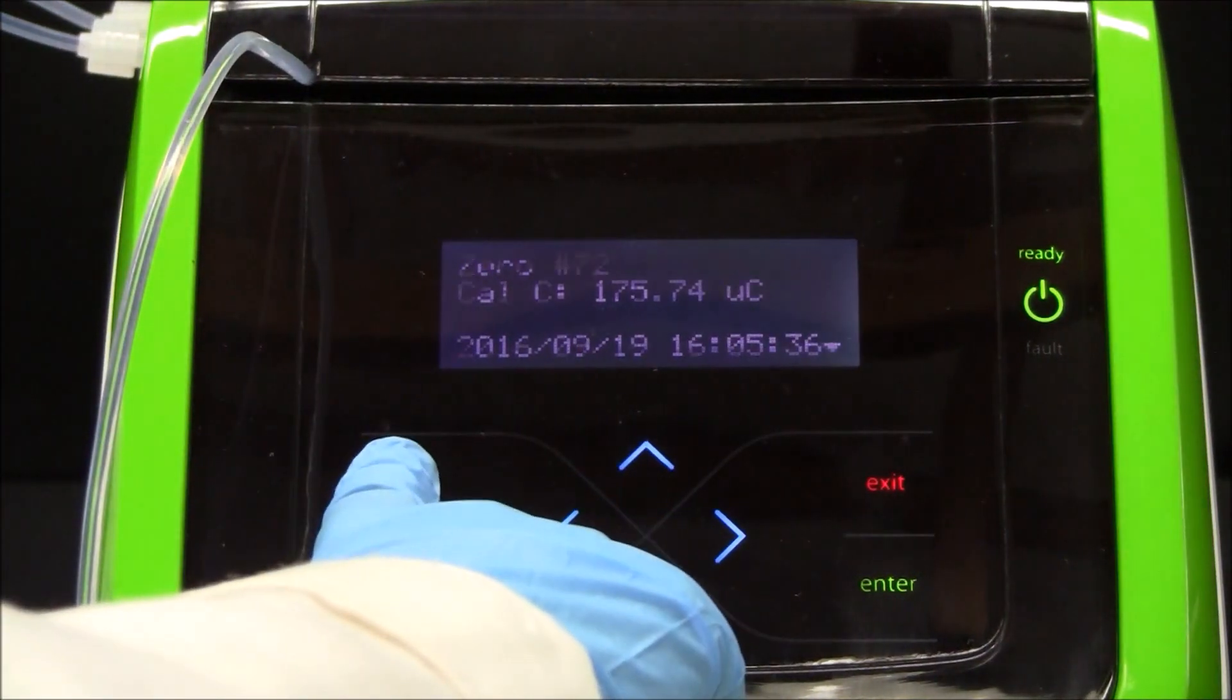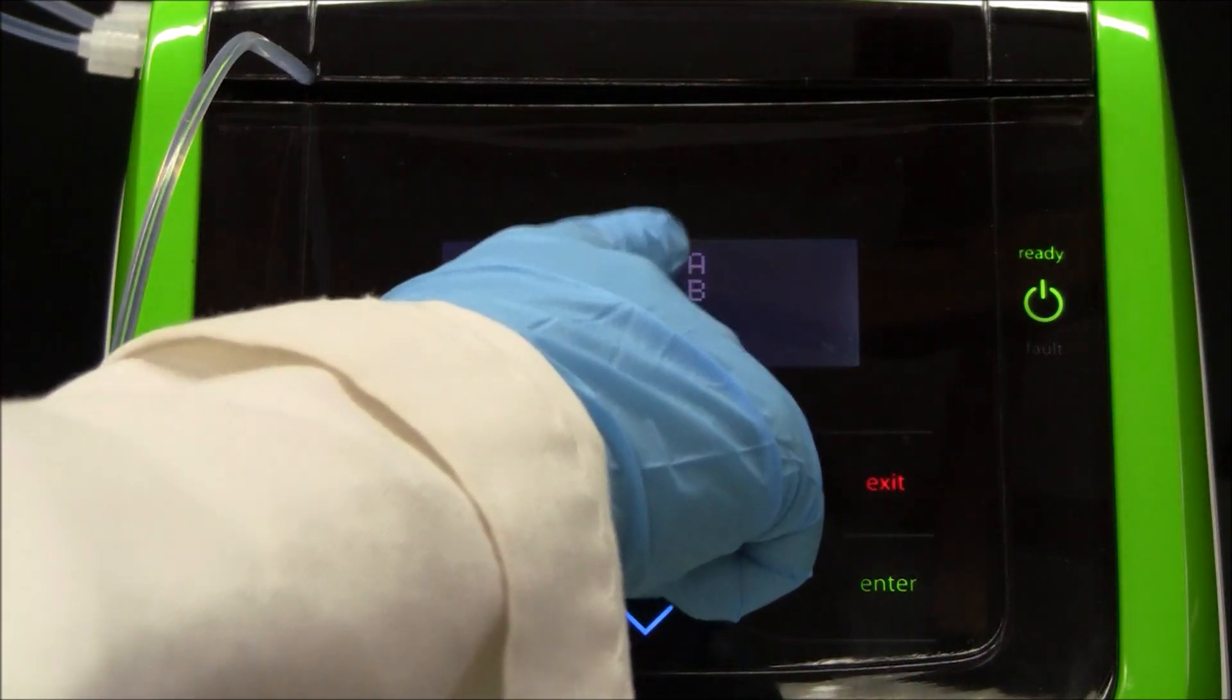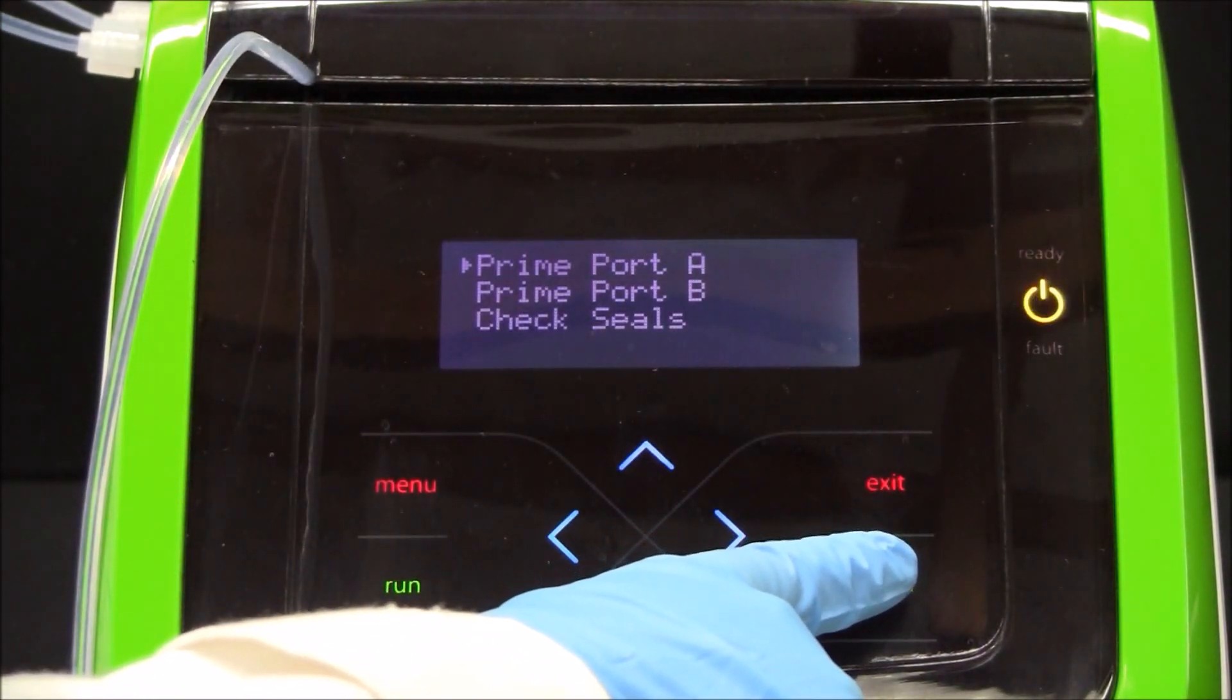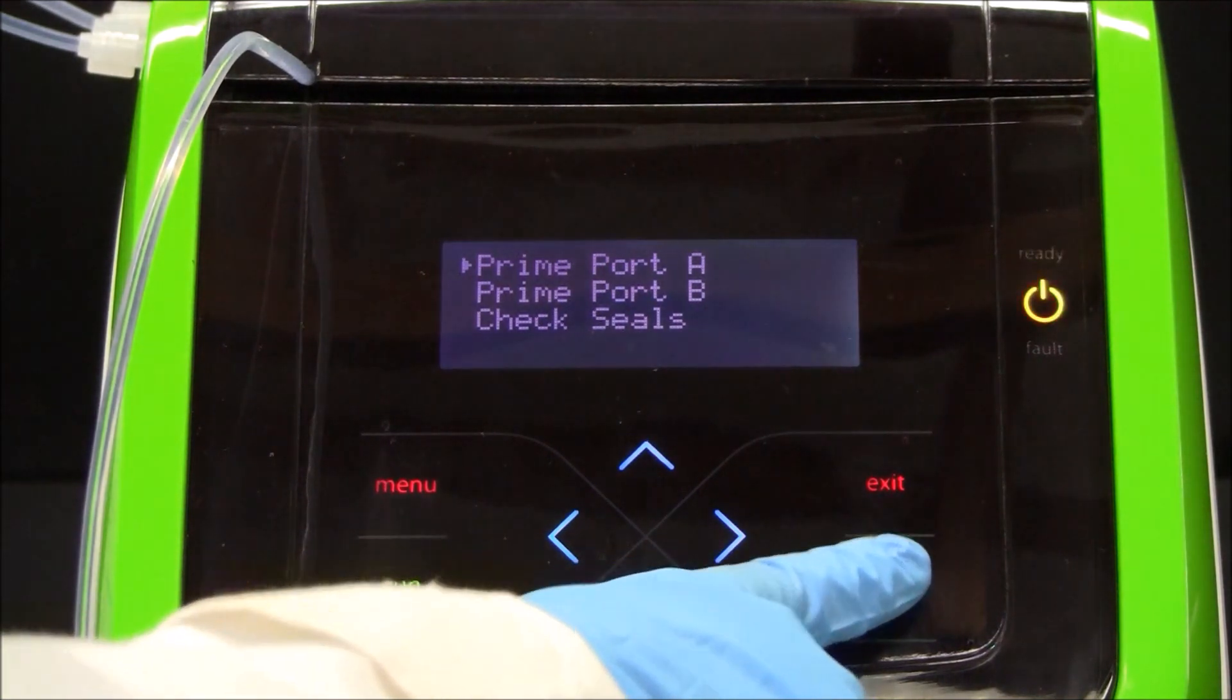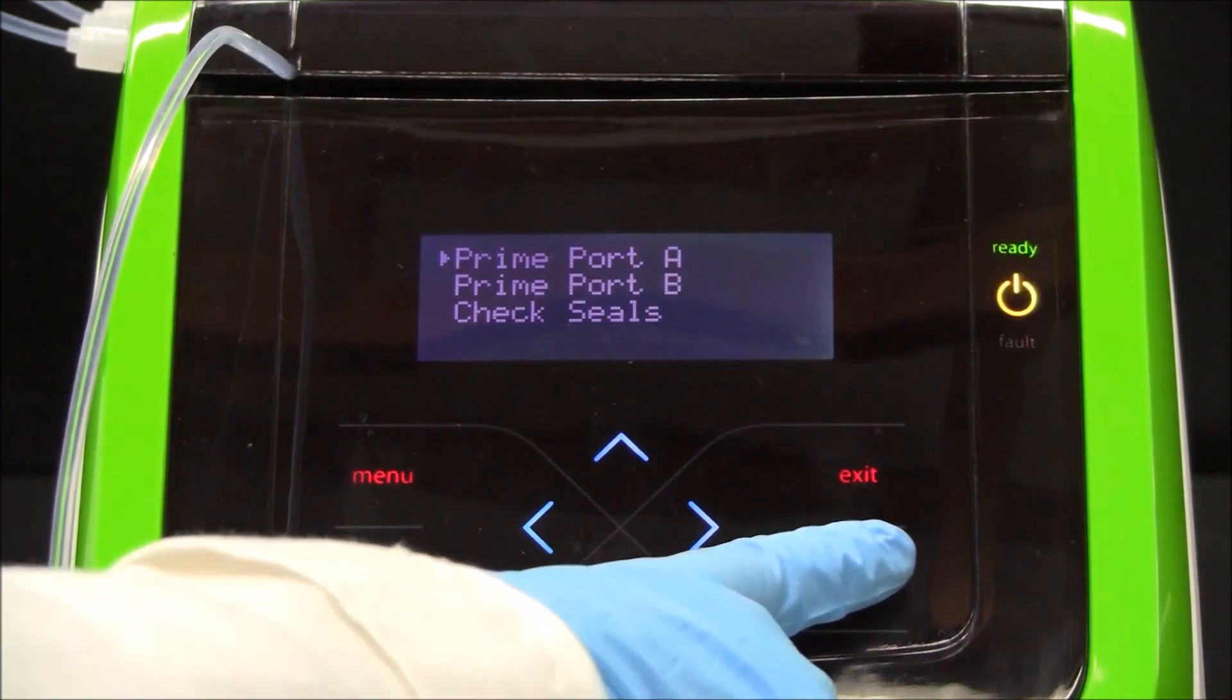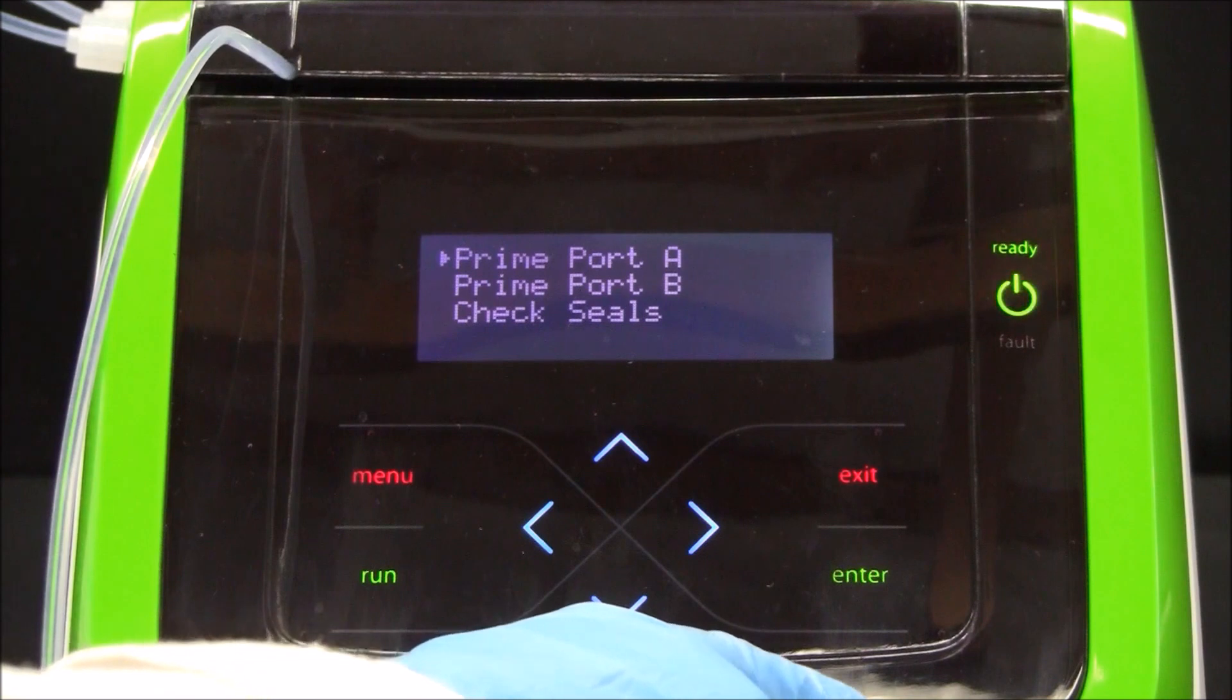In the operation menu, select prime lines. Prime port A three times to fill it with the sample. By the third prime, there should be a strong flow coming out of the waste port.